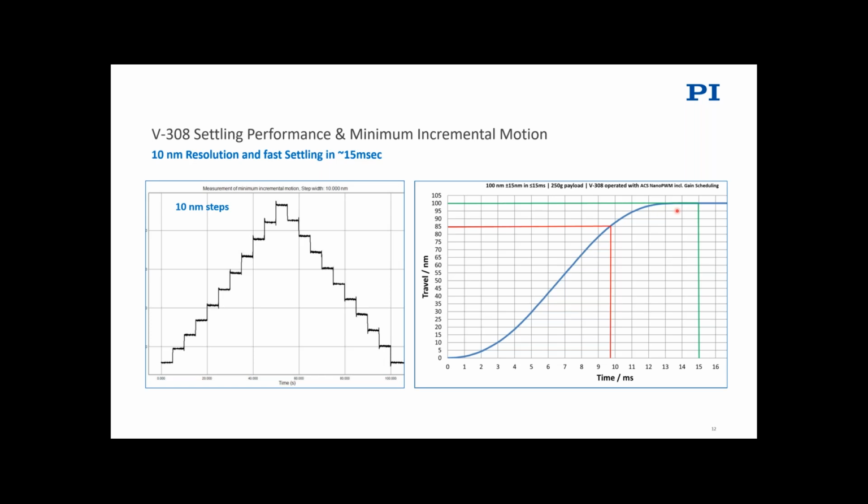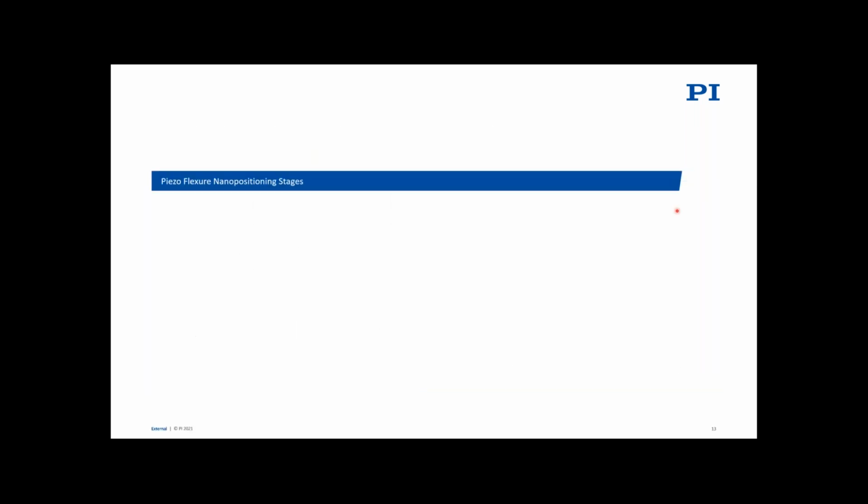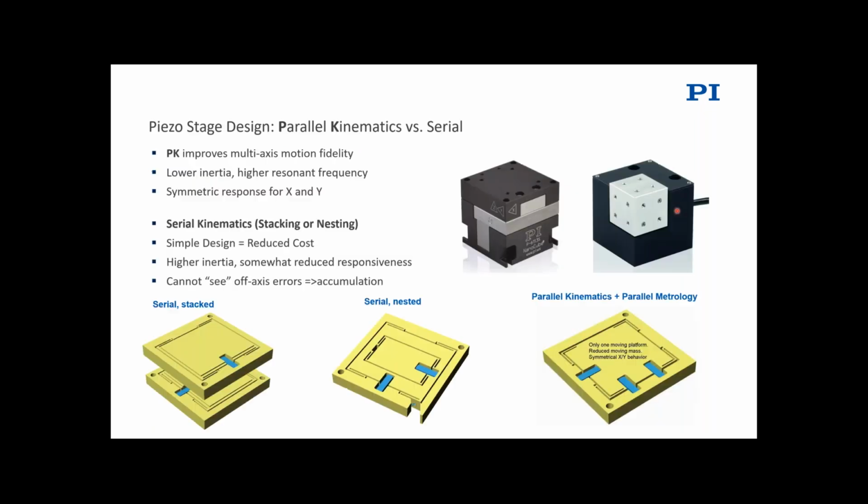travel ranges. So of course, a lot of times we want to do multi-axis positioning as well, and maybe do sample scanning in AFM, SPM, in XYZ. And we have to consider some different mechanical designs that we can do.